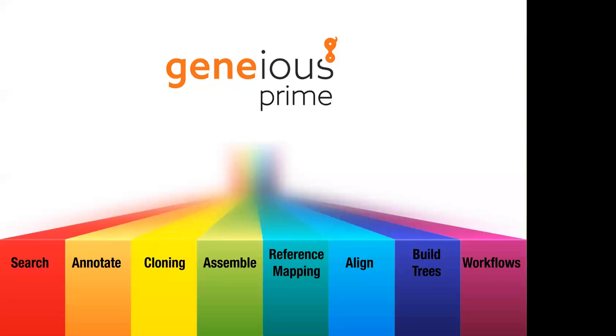Or if you want everybody in your lab to analyze your Sanger sequences the same way, or maybe you've got interns or students that you want to analyze the Sanger data all in the same way, you can create a workflow that does that. So they're a very powerful tool within Geneious. What I would say is get familiar with the tools in Geneious first, and then once you're comfortable with it and you find there's certain things you're doing again and again, definitely take a look at workflows at that point. So that's the high level overview of what Geneious can do.